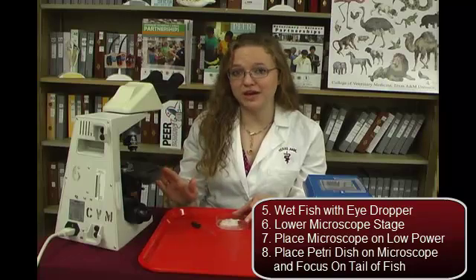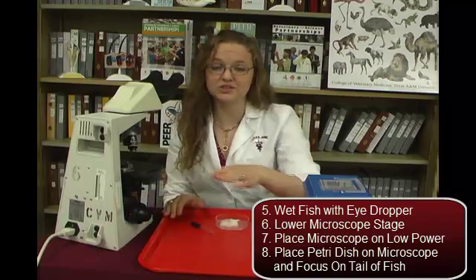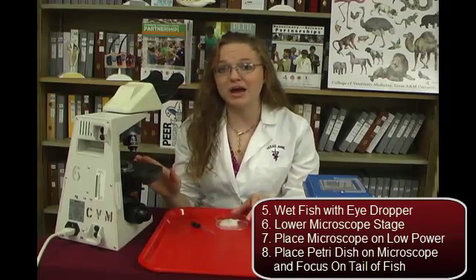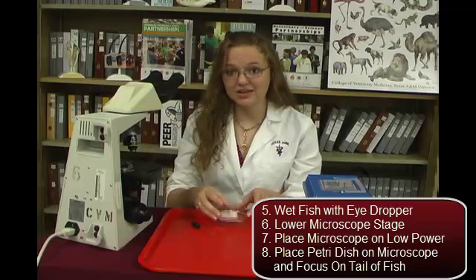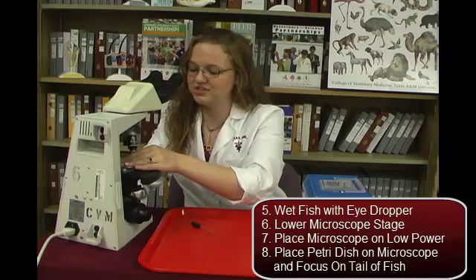Before we put the fish onto the microscope, we want to make sure that the stage is all the way down so that the lenses don't hit the petri dish. We want it to be on a low power, like 4x. Now we can put the petri dish onto the microscope and focus in on the fish's tail.